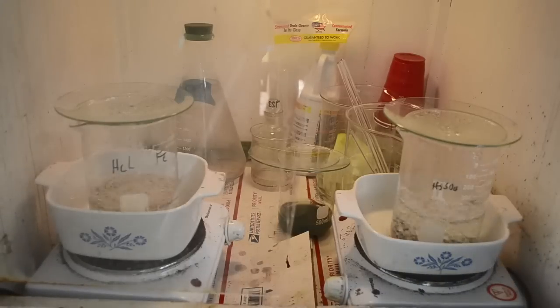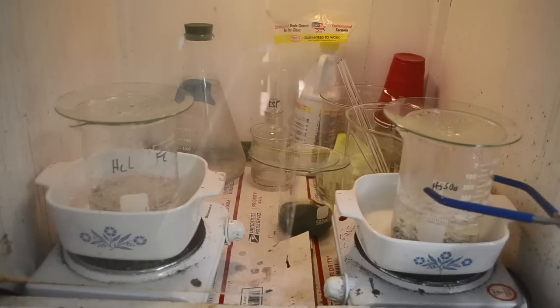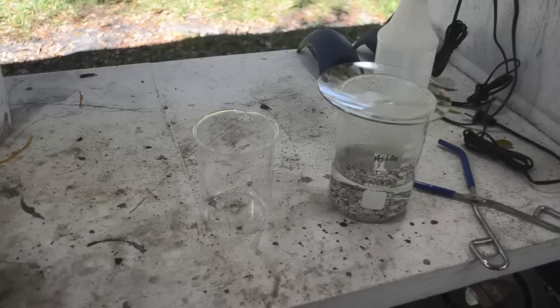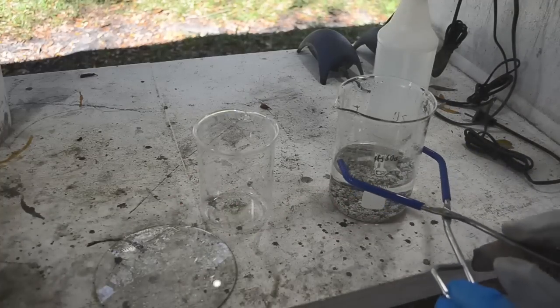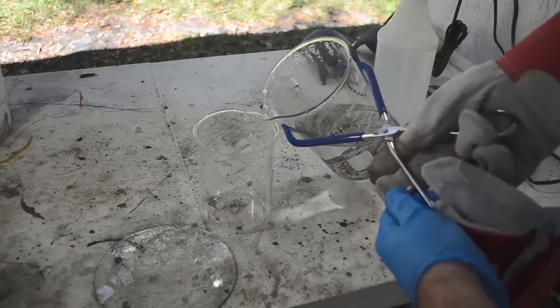And the sulfuric acid one, I'm gonna pull off the heat and over onto the bench. And I'll show you what we're going to do with it. All right, so what I want to do with this stuff is I want to immediately pour the liquid off. I don't want it to stay on the silver.